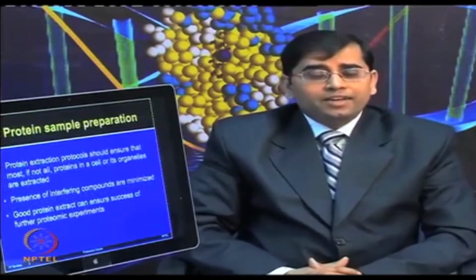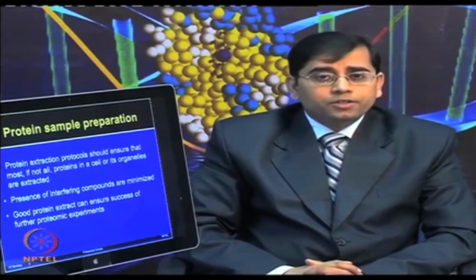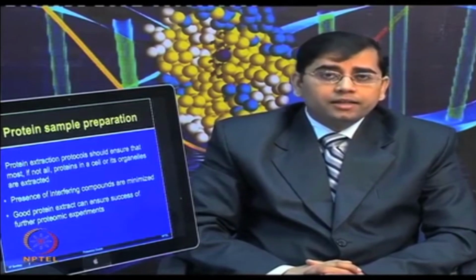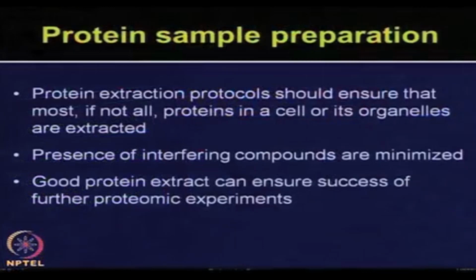Now, protein extraction protocols need to ensure that most, if not all, of the proteins in a cell or its organelle are extracted. The presence of interfering compounds should be minimized. So, if you have optimized a very good protein extraction procedure, that should ensure that you have a very wide proteome coverage, and that is ultimately going to determine the success of your proteomic experiment.